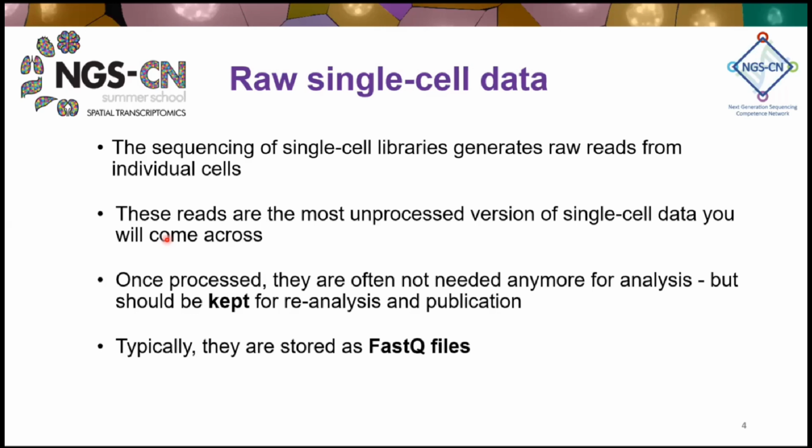And also, now every journal wants the raw data. So once you have done your single-cell data analysis, you have analyzed the data for months and have a good result, a nice UMAP, and so on, but then the journal wants to have the FASTQ files and you don't have them anymore. That's probably not a good situation to be in.